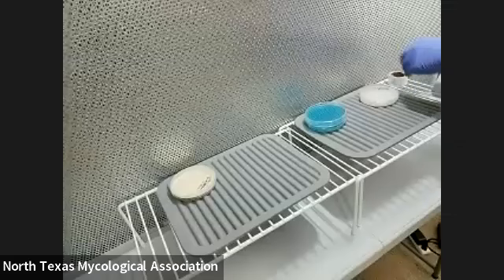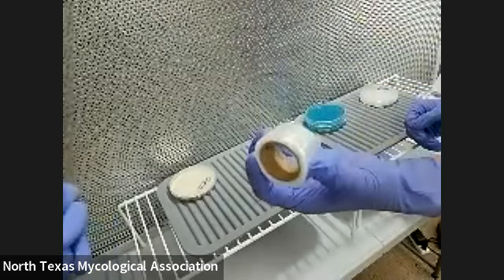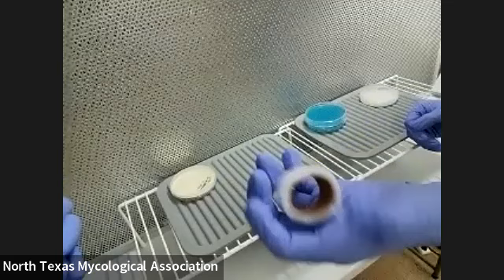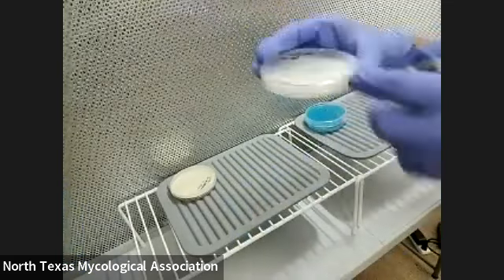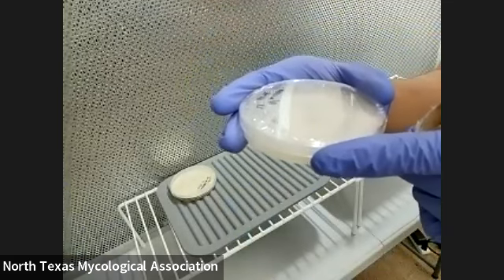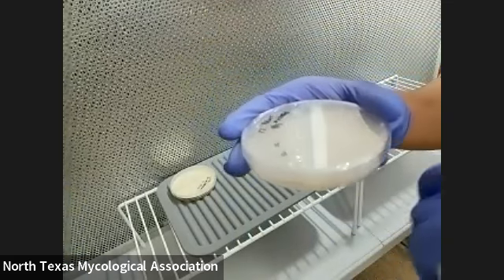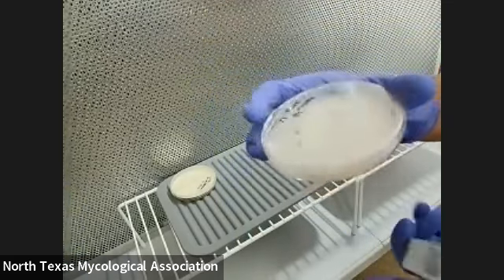One more thing we're going to use is cling wrap that I cut into a handheld size, just because we have to wrap the plates. These plates are vented, so if they're not wrapped, mold and bacteria from the air can get inside. So every time you do it, you have to wrap it.